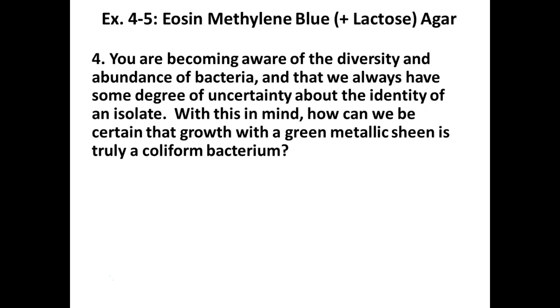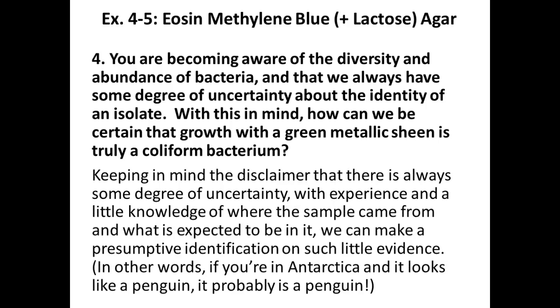So, if it's metallic green, is it definitely E. coli? No, right? It's a pretty strong indicator that it may be E. coli, right? If it looks like a penguin, it probably is a penguin, right? So in most cases it'd probably be E. coli, but it could be something else. So again, we would always do further testing. For you guys, the one that is metallic green really is E. coli.